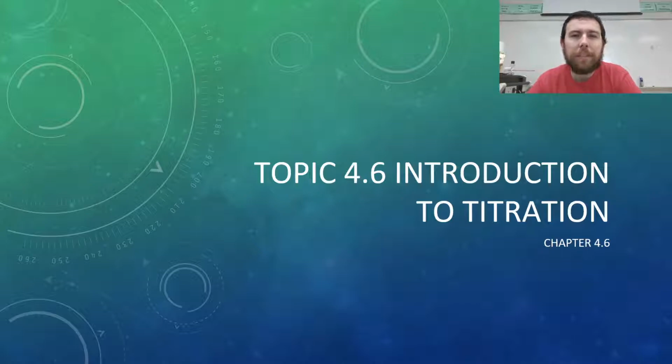We're going to be continuing our work with solutions and aqueous reactions by talking about a chemistry technique known as titration. It's a really important technique that has lots of applications. The one application we're going to specifically be focusing on, at least for right now, is titration in the context of acid and base reactions. Let's go ahead and dive right in and take a look at it.